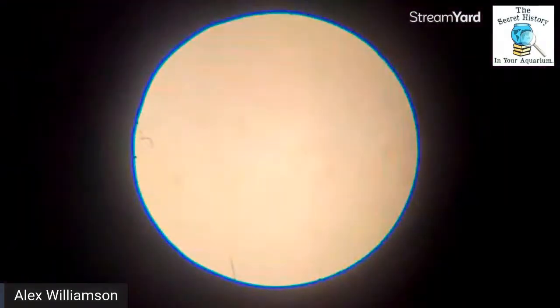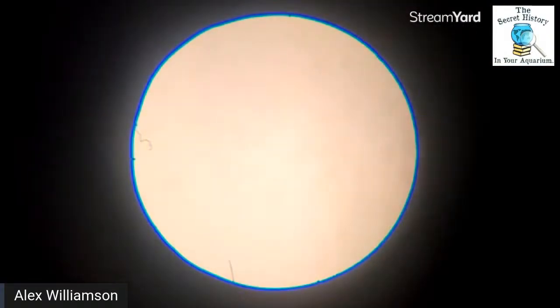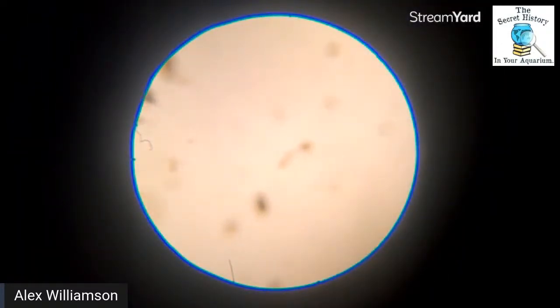I'm going to use a fresh slide. All right. Oh, he's going to go crazy. He's not happy. And it looks like we have a Cyclops or Triclops. I don't know. We'll find out. Let me wait for him to get to the other side of the puddle, and then I'm going to take some of the water out so we can find him quicker. All right, there we go.